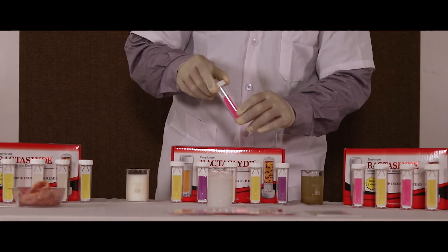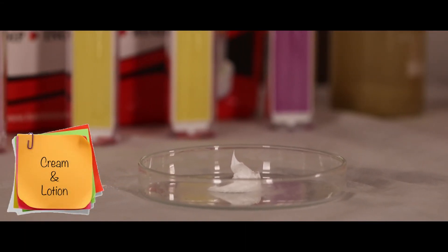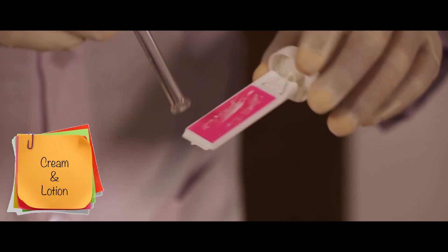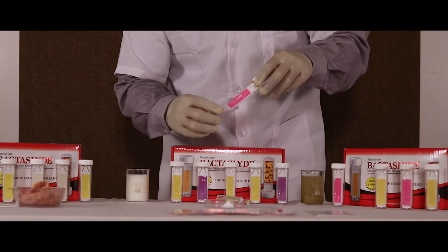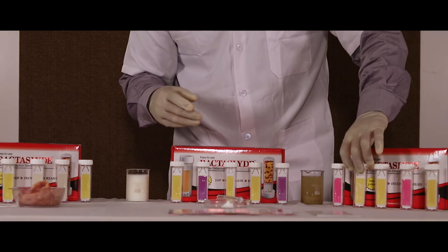Allow it to incubate for 18 to 24 hours at room temperature. For cream and lotion, take the sample in a glass container. Using a glass rod, rub it on either side of the slide. Make sure the glass rod is disinfected using alcohol. Put the slide back in the tube. Allow it to incubate for 18 to 24 hours at room temperature.